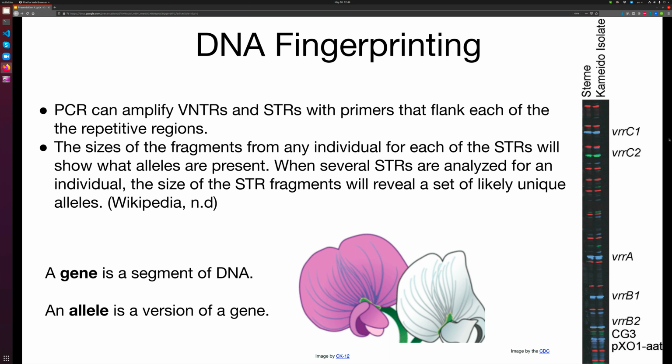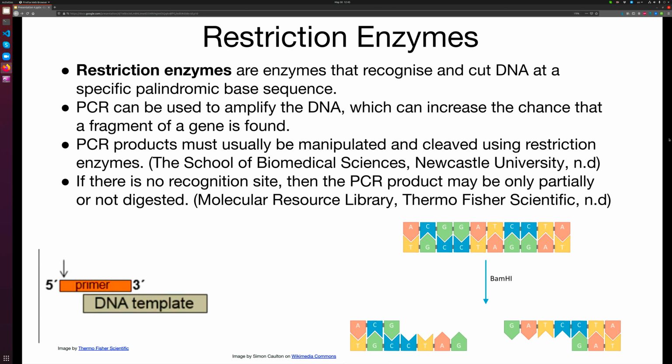It's very hard to notice. Some of them are slightly brighter or dimmer, but they're super hard to notice. This is a very rare scenario. Usually there would be one gene that is present and another absent, or one gene that is significantly brighter on the electrophoresis diagram than the other gene.